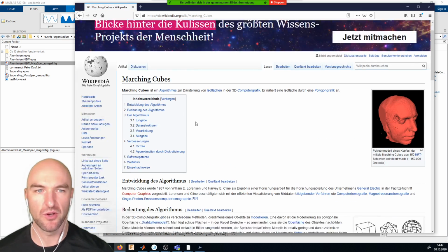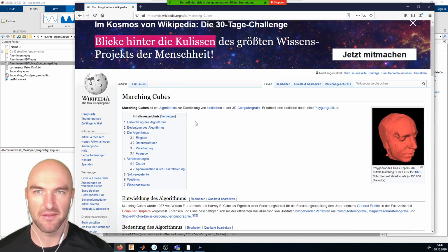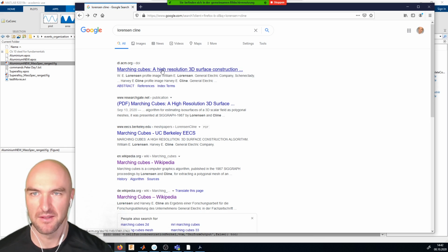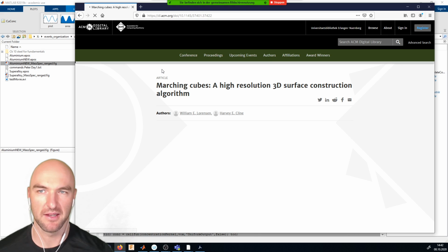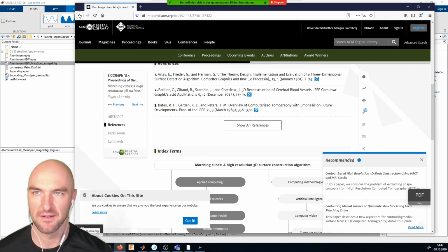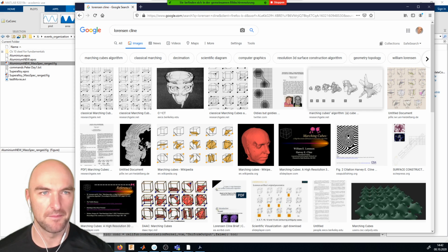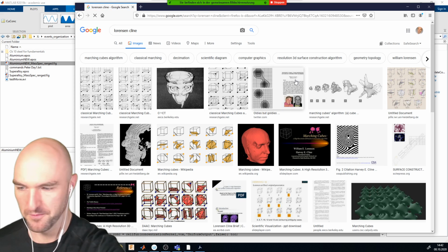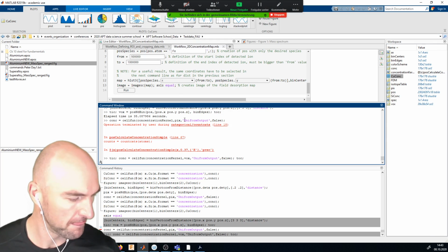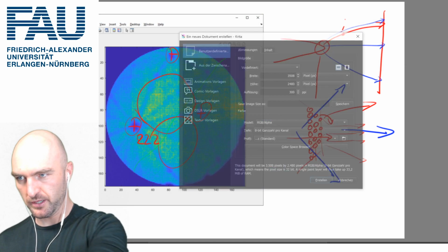An isosurface is essentially equivalent to the height lines in a map. And this is not a particularly nice display of that. Do we have something nicer? Okay, let me just draw that for you.